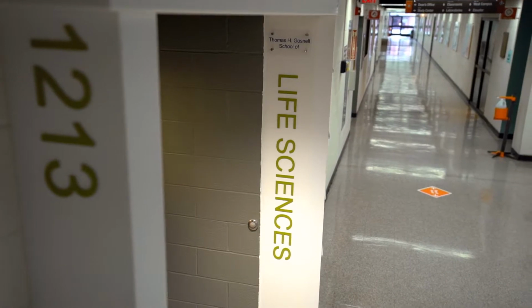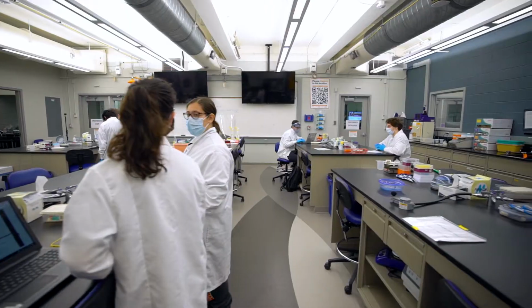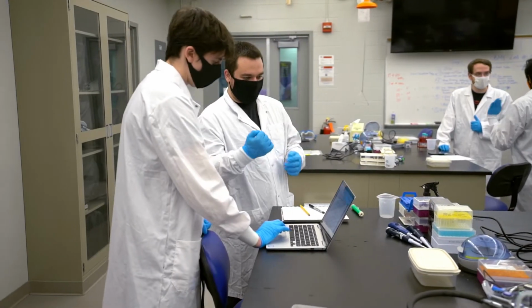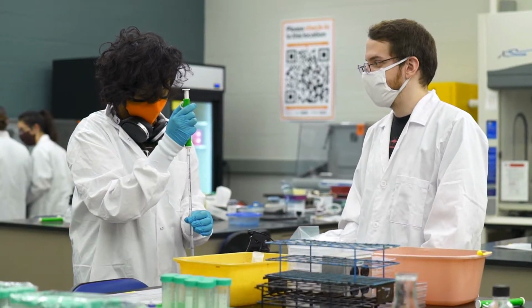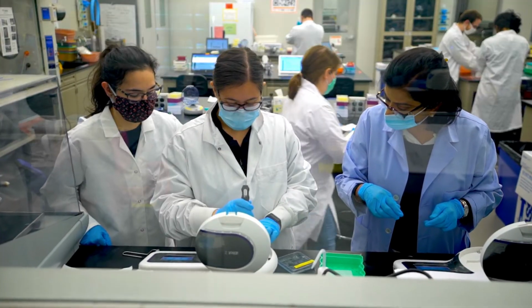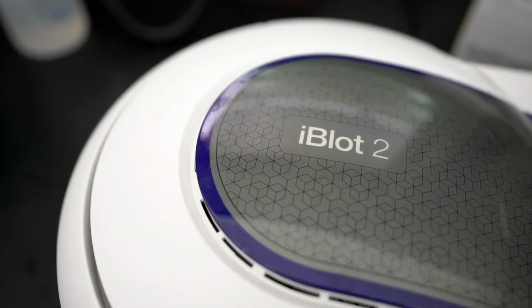In this lab, undergraduate students will learn important molecular biology skills that they put to use in advanced coursework, advanced lab work, and also their future careers in science. In our hands-on lab course, students learn how to work with and genetically manipulate E. coli bacteria. Later on, they learn how to isolate proteins, DNA, and RNA from these laboratory strains.